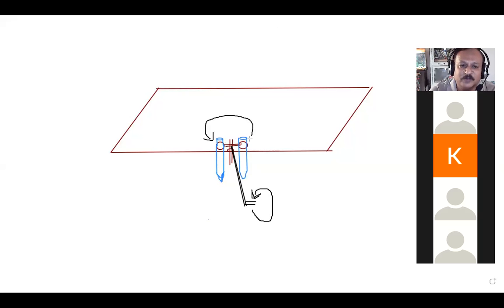So I'll show you the position. If you move the handle very fast, then the tubes would actually move like this.